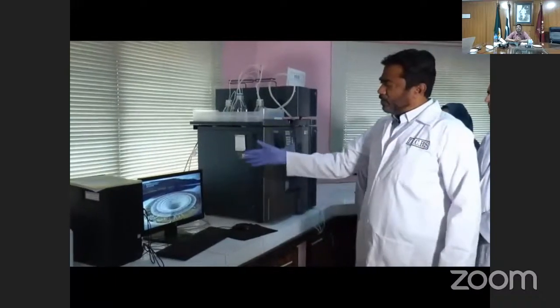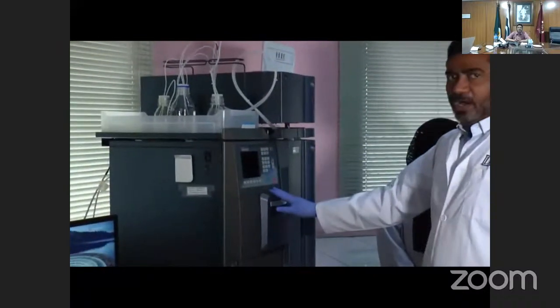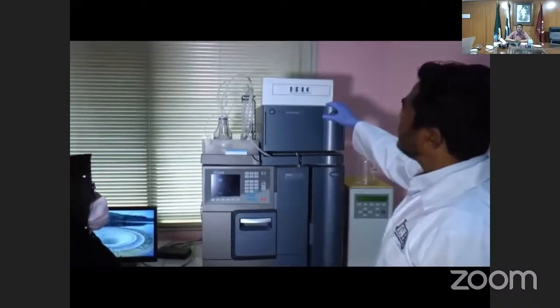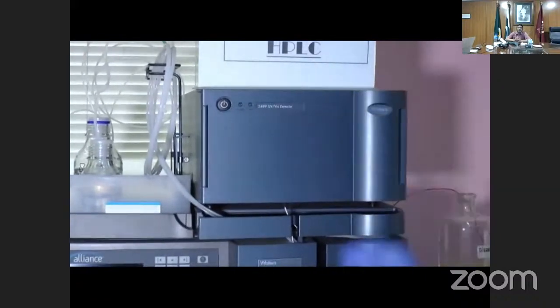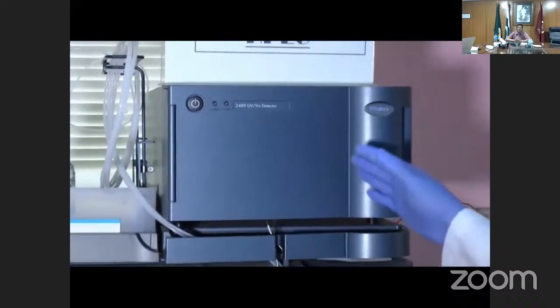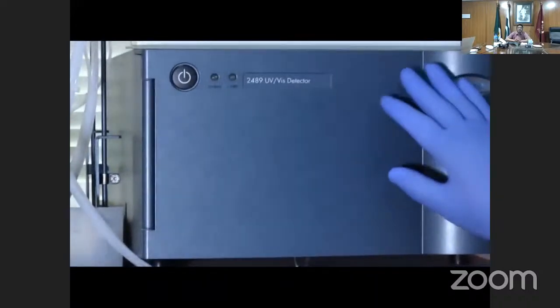It is involved in data collection, which is generated by this hardware system. Yesterday, as I mentioned, the theoretical aspects of HPLC, and now this is the simplest HPLC system having only one detector. This is the UV detector.